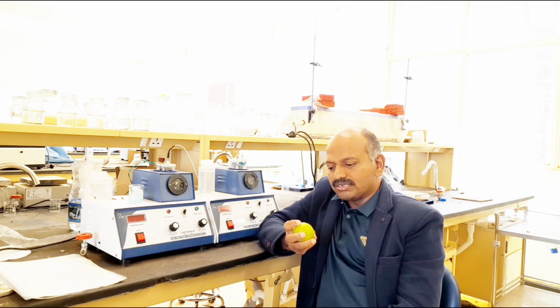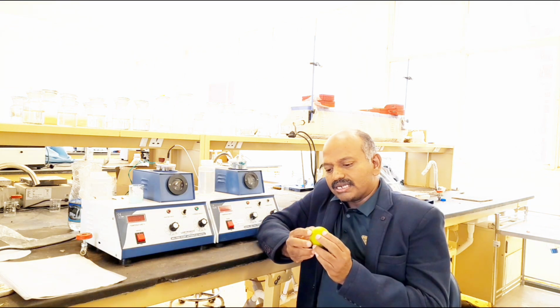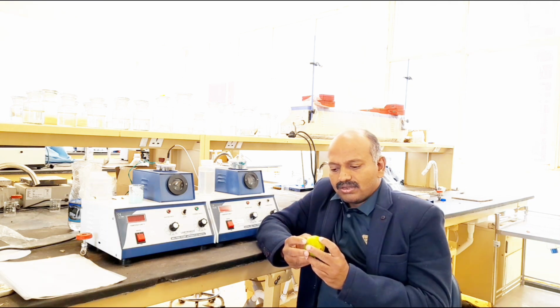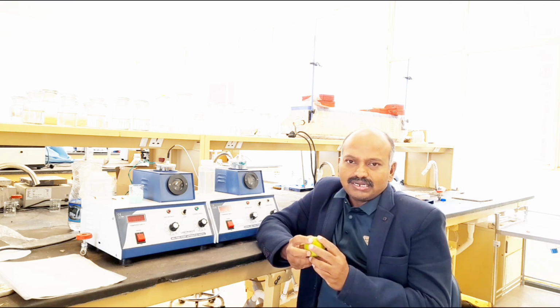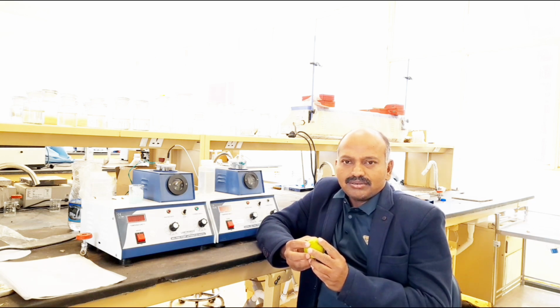So coming to the procedure, the aim is to determine the amount of citric acid present inside the lime juice, and the apparatus will be the same: burette, pipette, conical flask, glass rod, volumetric flask, beakers, and analytical balance. Now, coming to the main procedure, we have to take 10 ml of this lime juice into the conical flask, and then take the 0.1 molar sodium hydroxide solution into the burette.